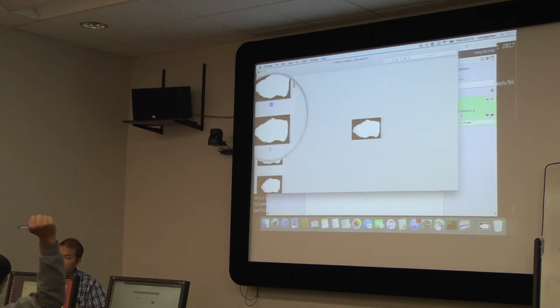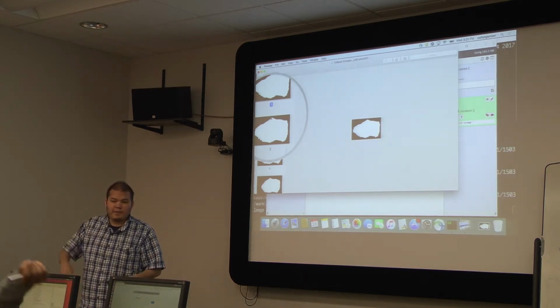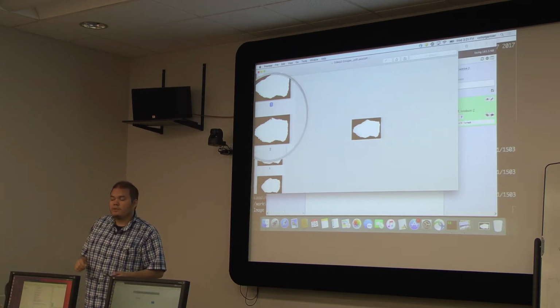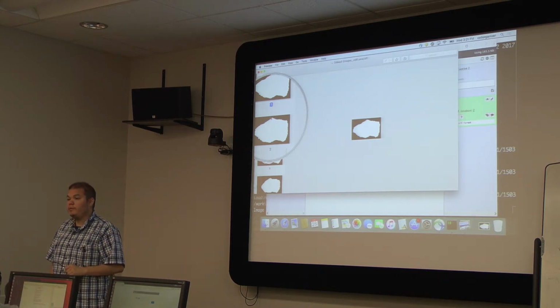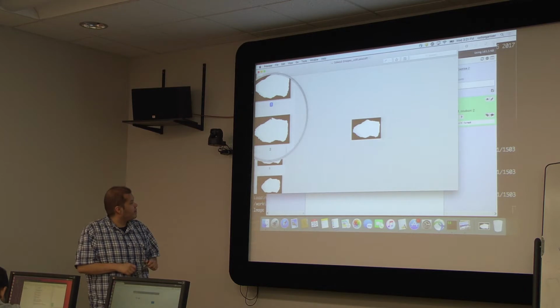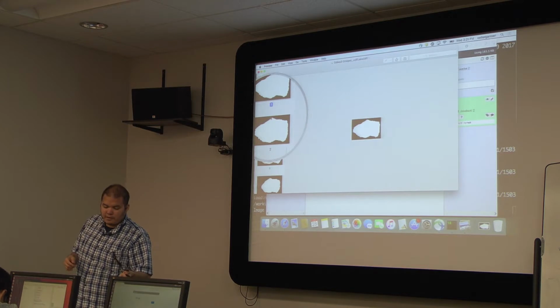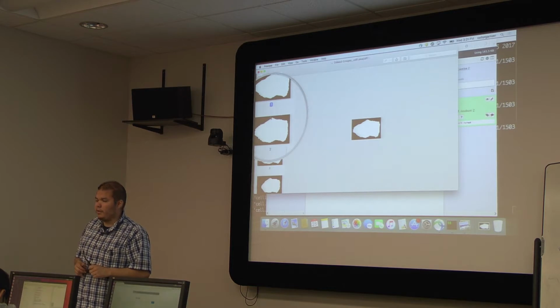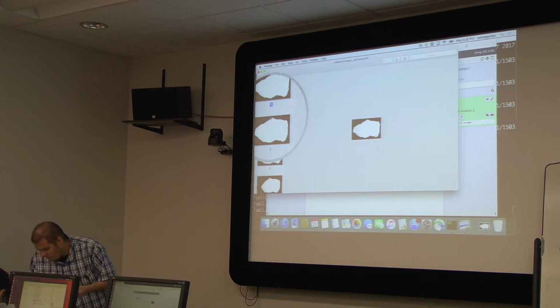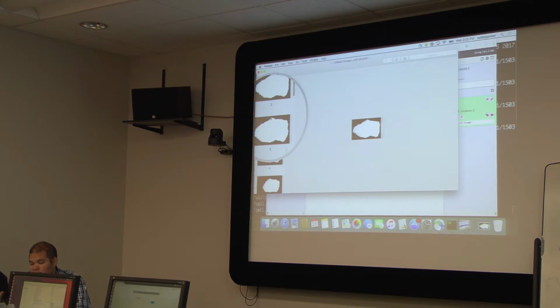Okay. Why is the image so small? Well, because I downsample while I trained, so I produced an image that was smaller than the original resolution. Okay. In the desktop version of CellOrganizer, you're allowed to upsample if necessary. You can force the system to do that. That's especially useful when you're synthesizing from like a diffeomorphic model, but you want a high resolution, and let's say the microtubule model. You can do that. And then again, this is an OME TIFF. Now we're at the stages where this is the nuclei, and that's it. And this is the cell.